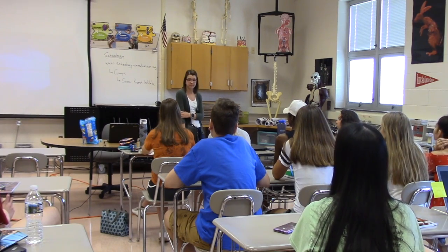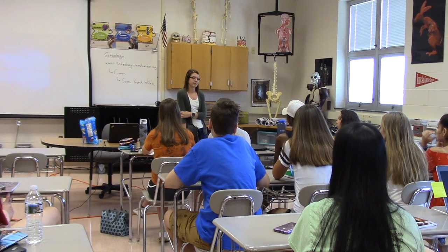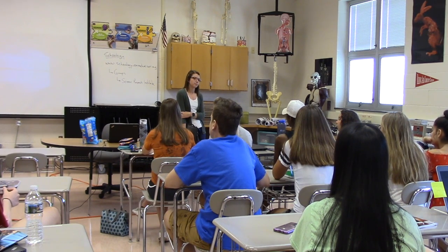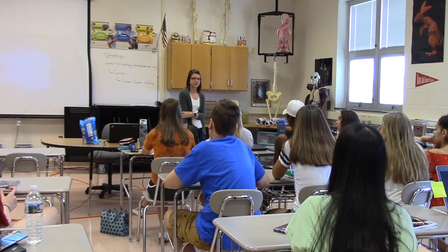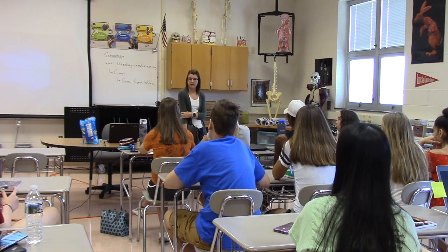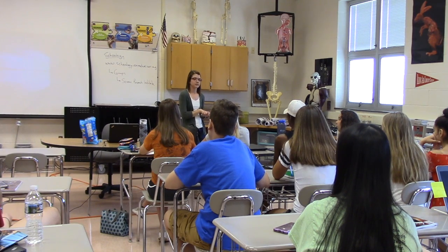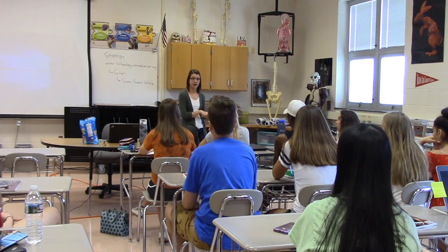Yeah? That works? Okay, so do you guys know what ELISAs are? So ELISAs measure protein concentration or antigen-antibody connection. So an ELISA is something you can do in a wet lab. You don't have to do it sterilely, so that's kind of nice. Those usually start with a coating antigen, and then you let it incubate overnight. And then the next day I would add my drug to that, and I would see how much of that drug is able to bind to that antigen.